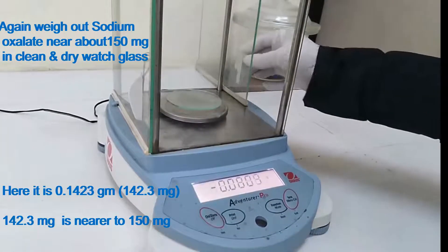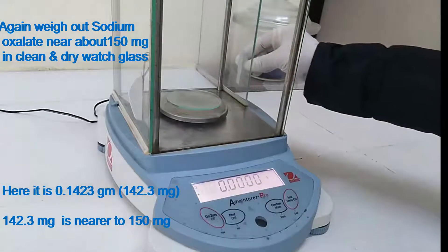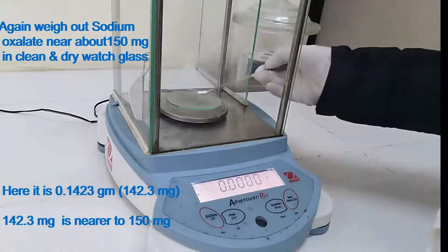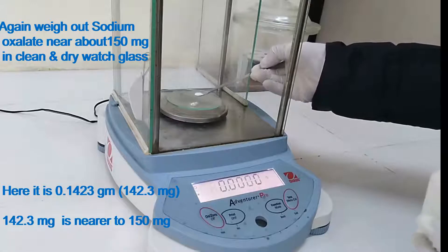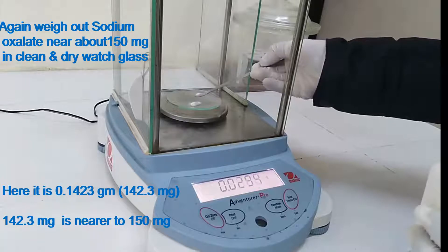Again, weigh out sodium oxalate near about 150 mg in a clean and dry watch glass. Here it is 0.1423 g, that is 142.3 mg, which is nearer to 150 mg.